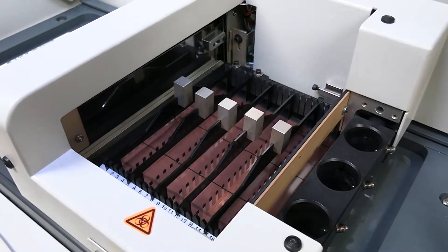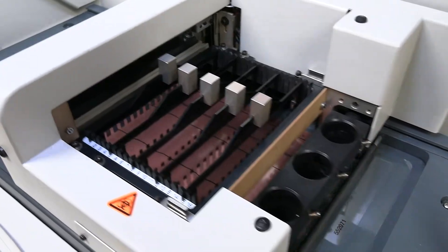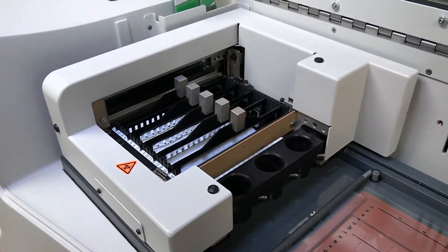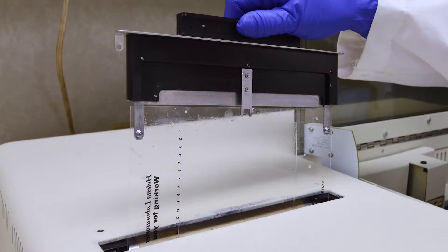The timing of Helena procedures are optimized to complete at roughly the same time. This allows for easier workflow and eliminates gels piling up waiting to be finished.